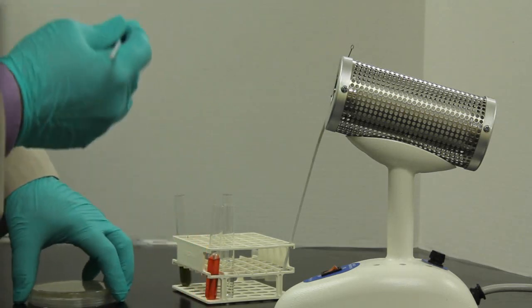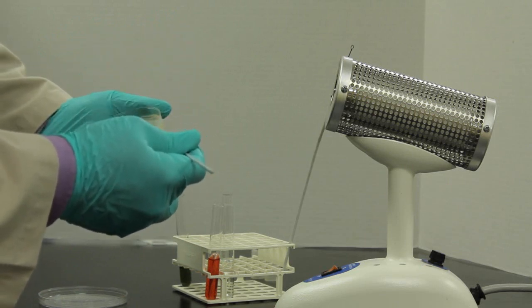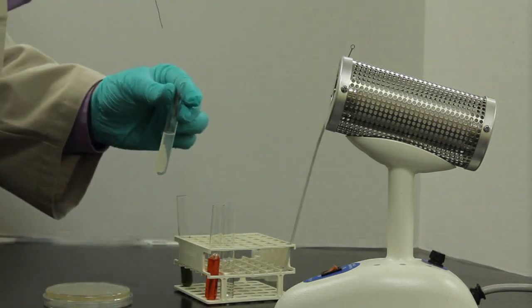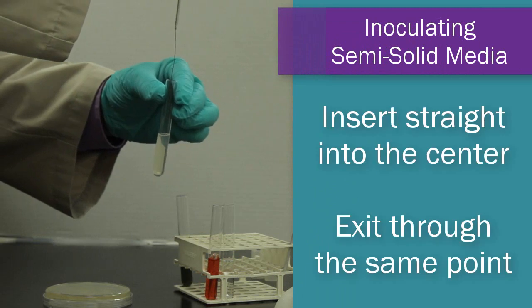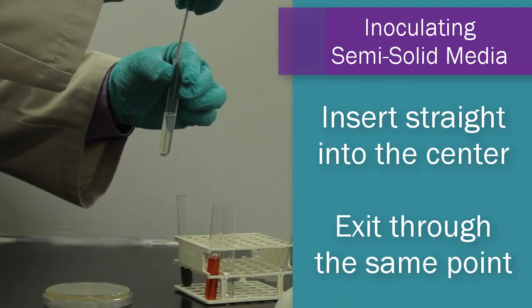So let's do this for the semi-solid. For the semi-solid, again, once it's cooled for 15 to 20 seconds, pick up an individual colony. With your semi-solid media tube, you're going to inoculate straight up and down through the center of your media. Go all the way to the base.